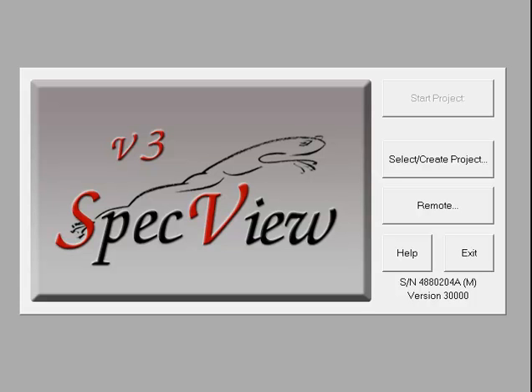This video will explain the auto detection feature in SpecView. Some instruments have an identity code which will tell SpecView what kind of instrument it is. How this is done varies from instrument to instrument, and not all instruments support the auto detection feature. Visit our website to see which instruments can be auto detected and which have to be selected using manual configuration.